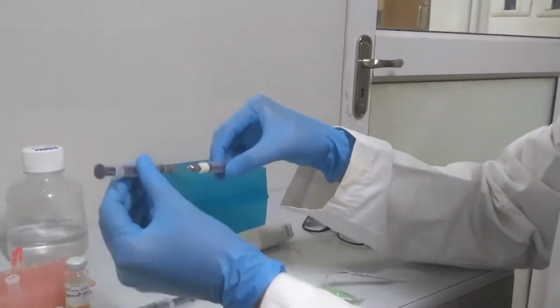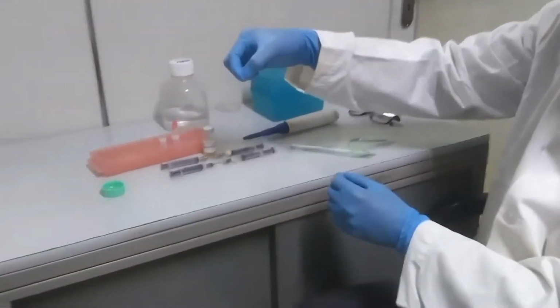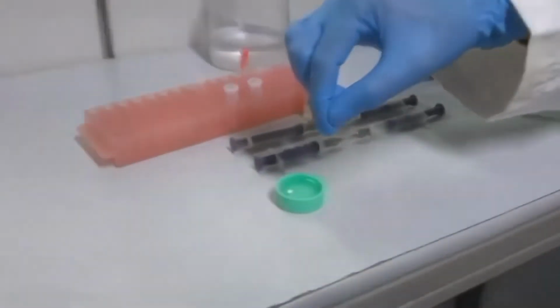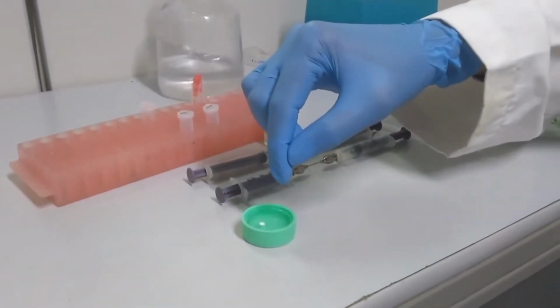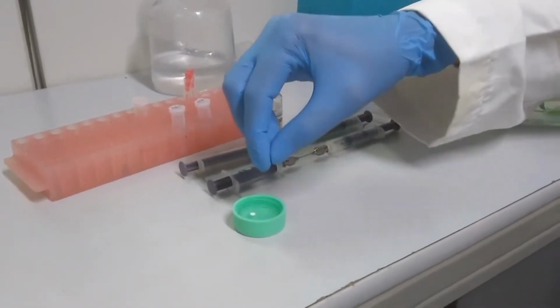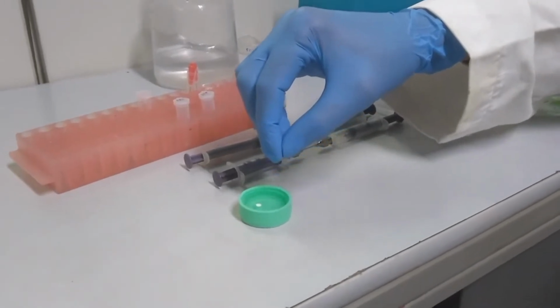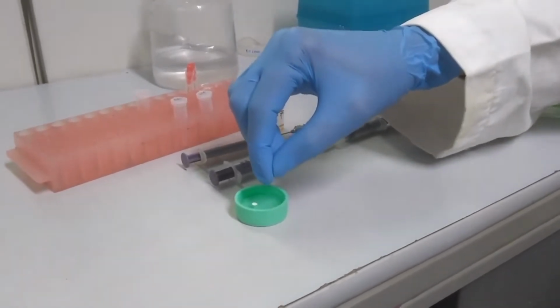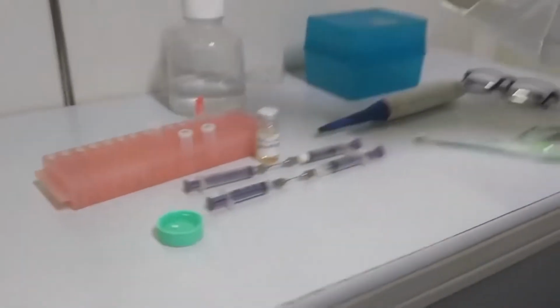So how do we check them? For checking purposes, we drop a drop of emulsion on the water surface like this. If the emulsion is not formed perfectly, this will spread out. Otherwise, it will not spread. So this is a check that your emulsion is formed correctly. Once you find that this drop is not spreading, your emulsion is actually ready for injection.